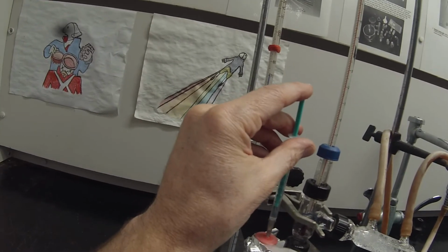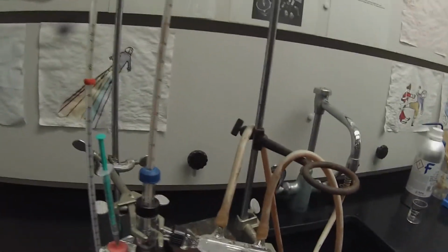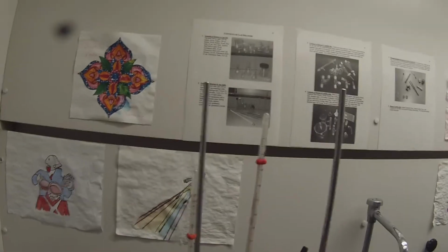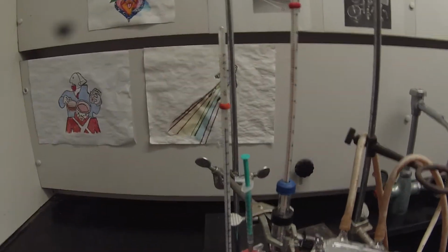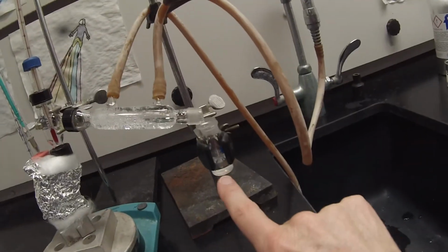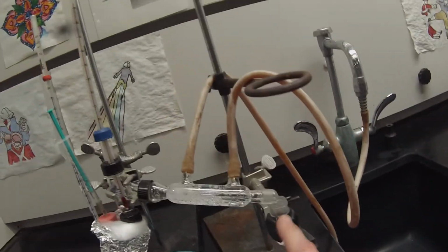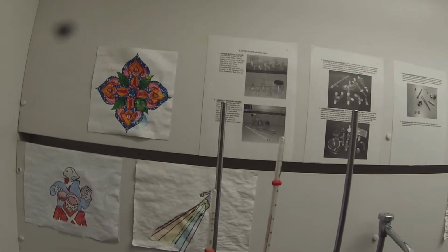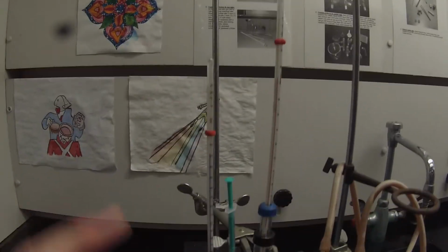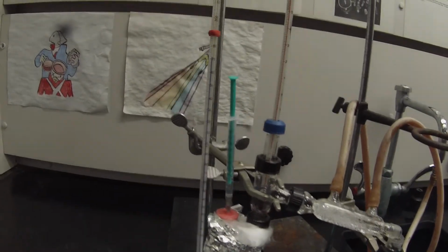Another 0.1 mil, sorry. And I've been saying milliliter, half milliliter, I meant 0.05, and when I've been saying 1 milliliter, I meant 0.1. The 1 milliliter syringe, not a 10 mil syringe. You can see there's some liquid collecting now, definitely dripping. This temperature seems to want to be at about 74 on the entire interior thermometer.